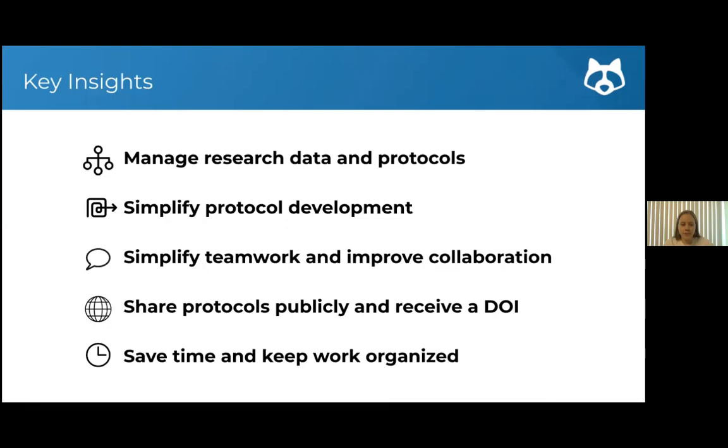Protocols can be kept private, but we also have an open side, so you can publicly share protocols and even receive a DOI for your methods. And overall, if you use protocols.io, in the long run you can really save yourself and your team time, and keep all your work organized.